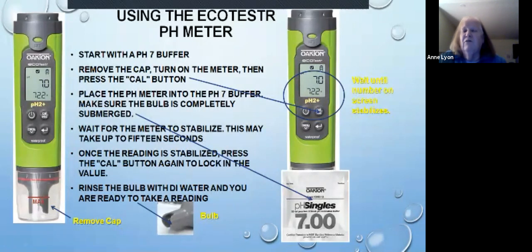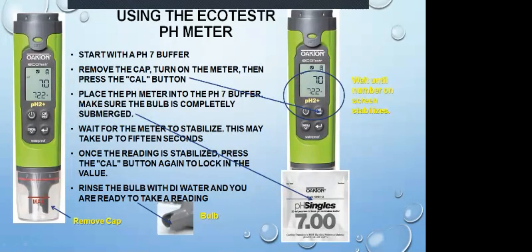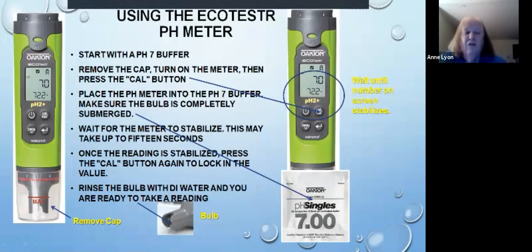Once you've done this at your first sample site, you just turn this unit off in between each place that you're going to go, and turn it back on. You do not have to recalibrate it. Just turn it on and put it into the sample, rinse thoroughly, and then this will have a little cotton ball in the bottom. While you're out there sampling, you won't worry about the storage solution. We'll put that in at the end after we've rinsed it all off, and then we'll fill it up to this line.